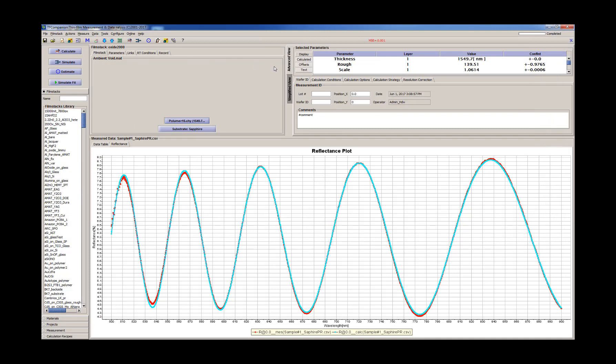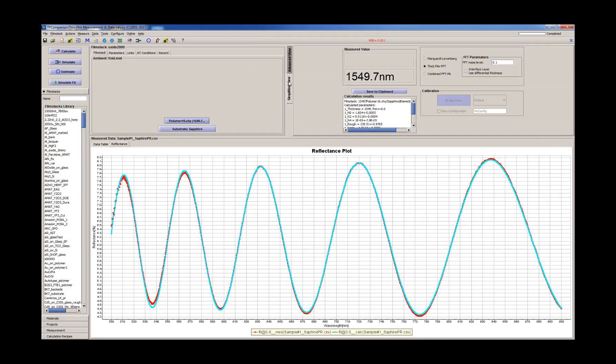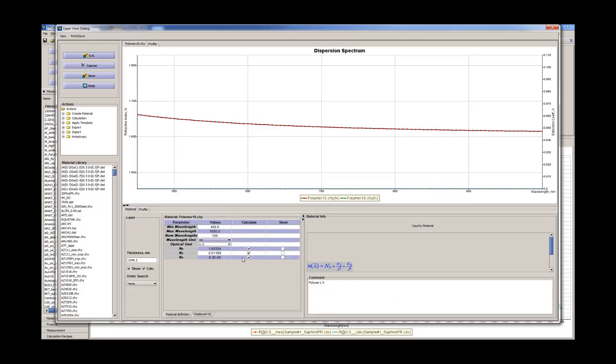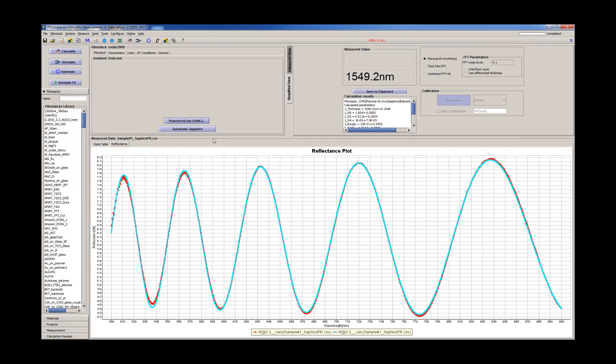Let's just recalculate to make sure. And now we can remove here calculation of the optical constants. We'll have them fixed. And we can save this film stack.